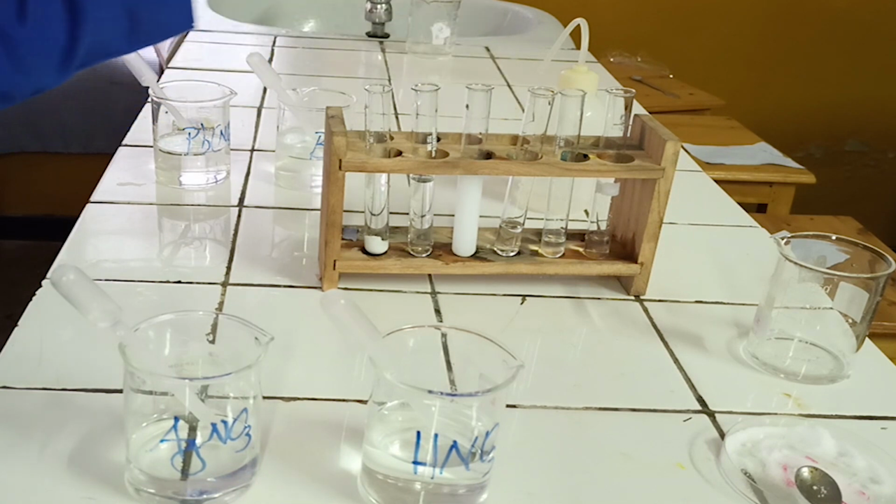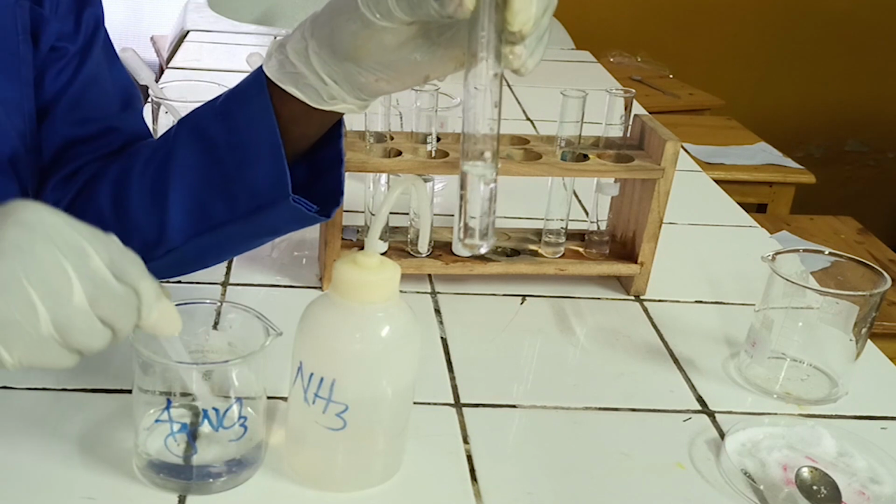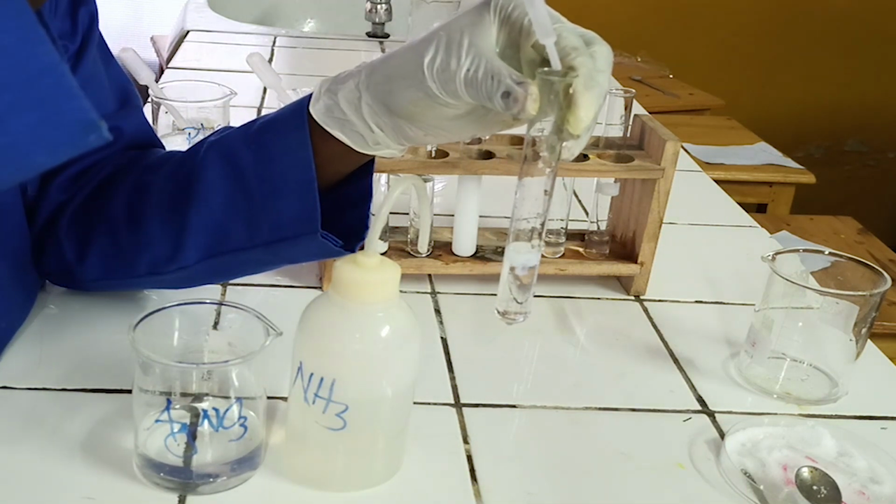Second confirmatory test. To the fourth test tube, add silver nitrate solution followed by excess of diluted ammonia.